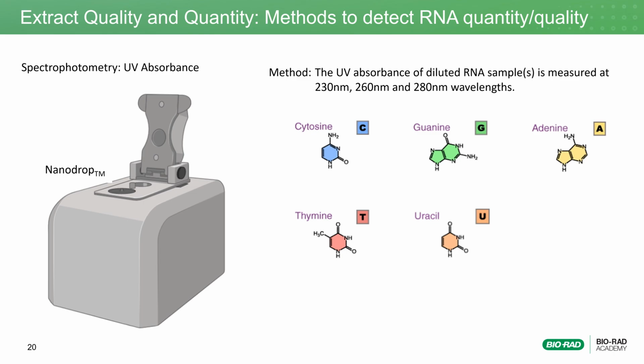If we assume that each DNA or RNA molecule is comprised of an average frequency of nucleotides, we would predict that the string of DNA or RNA molecules present in the sample would approximate the weighted average of the 260 to 280 ratio for the 4 nucleotides present. In fact, this is the principle applied in determining the presence of DNA or RNA in a sample when using the NanoDrop. Notice that uracil, the nucleic acid found in RNA, has a higher 260 to 280 nanometer UV absorbance ratio when compared to thymine. Therefore, the average value of RNA will be higher than DNA.